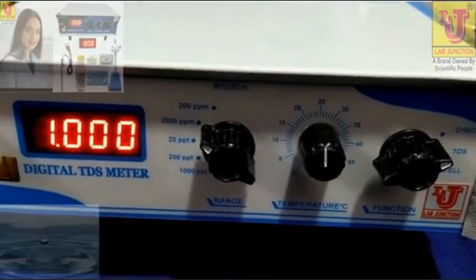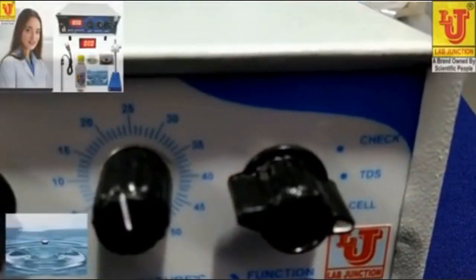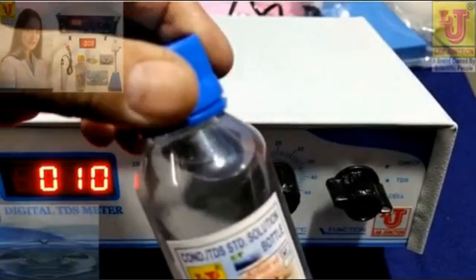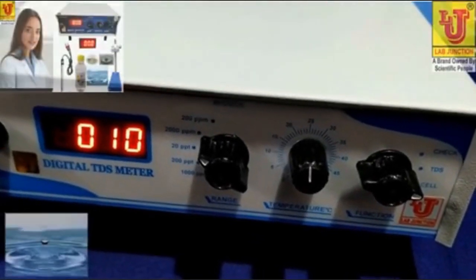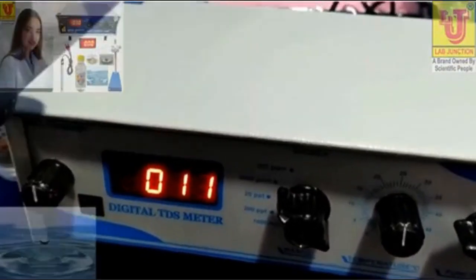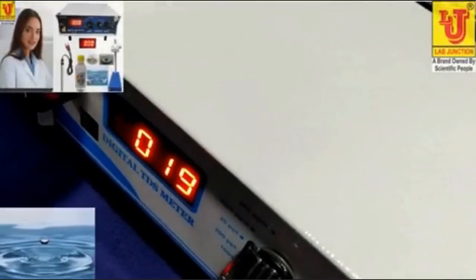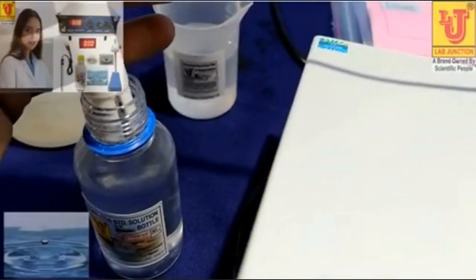Now you go to TDS control. This is the standard solution. I am opening this like this. Dip in the standard solution.